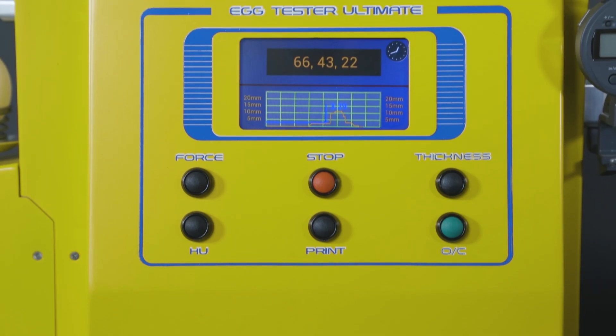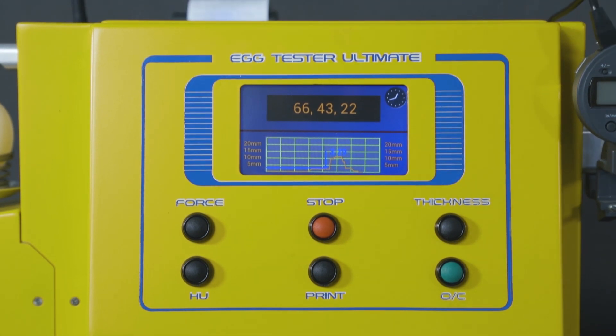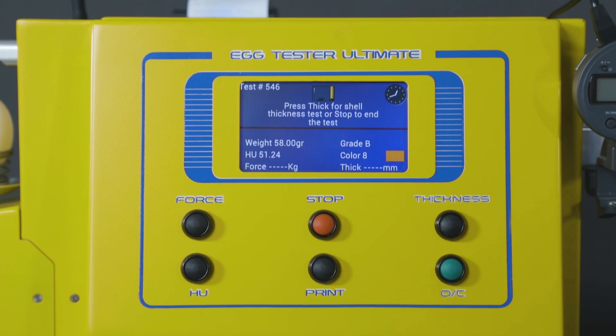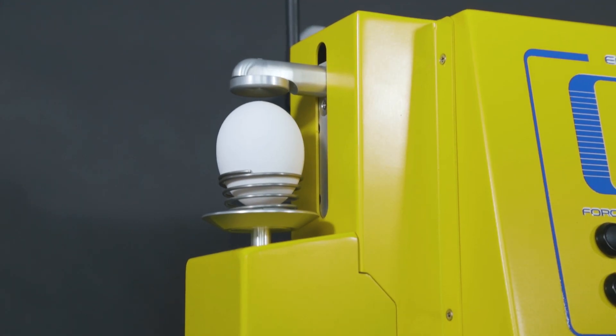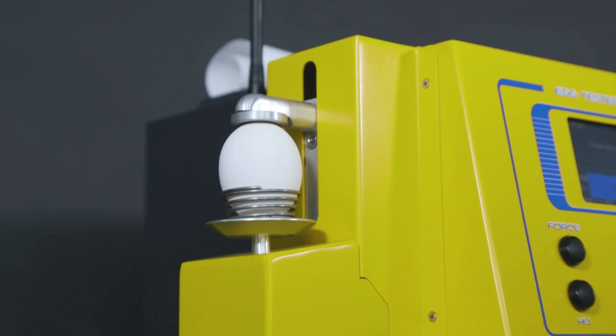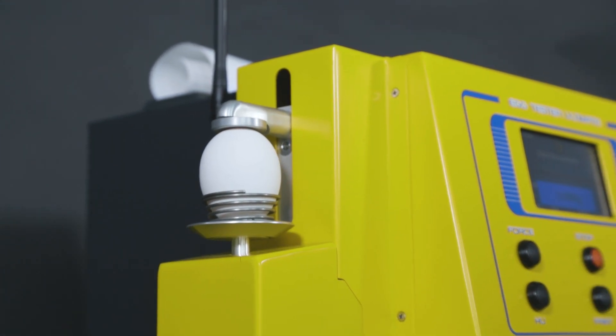The Egg Tester Ultimate uses the latest technology to self-calibrate each time the machine is turned on, thus providing a far more sophisticated and accurate calculation without ever having to worry. Despite all the science and technology behind it, the Egg Tester Ultimate is simple enough for anyone to use.